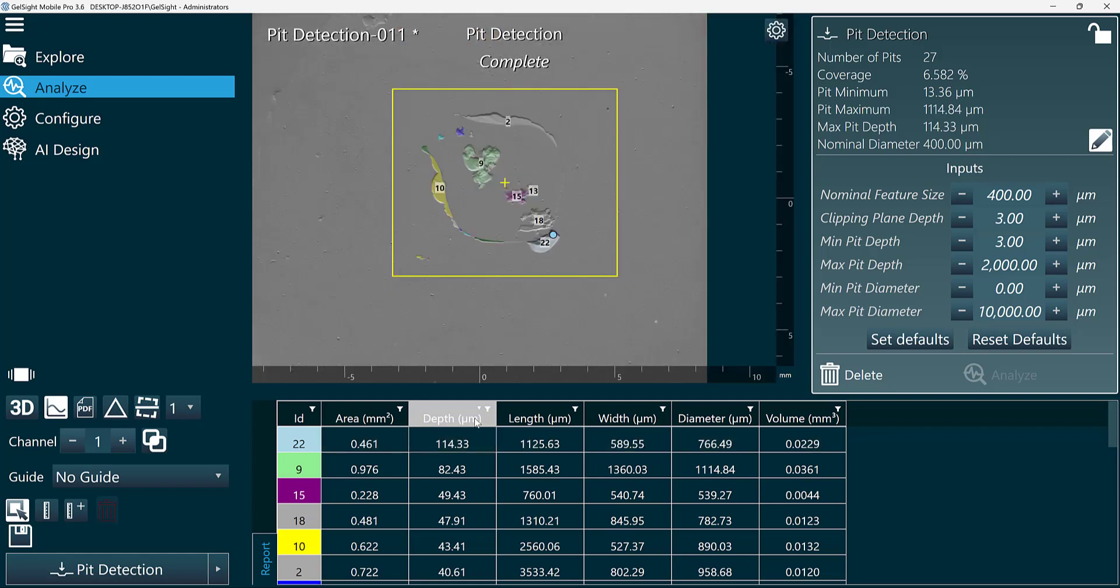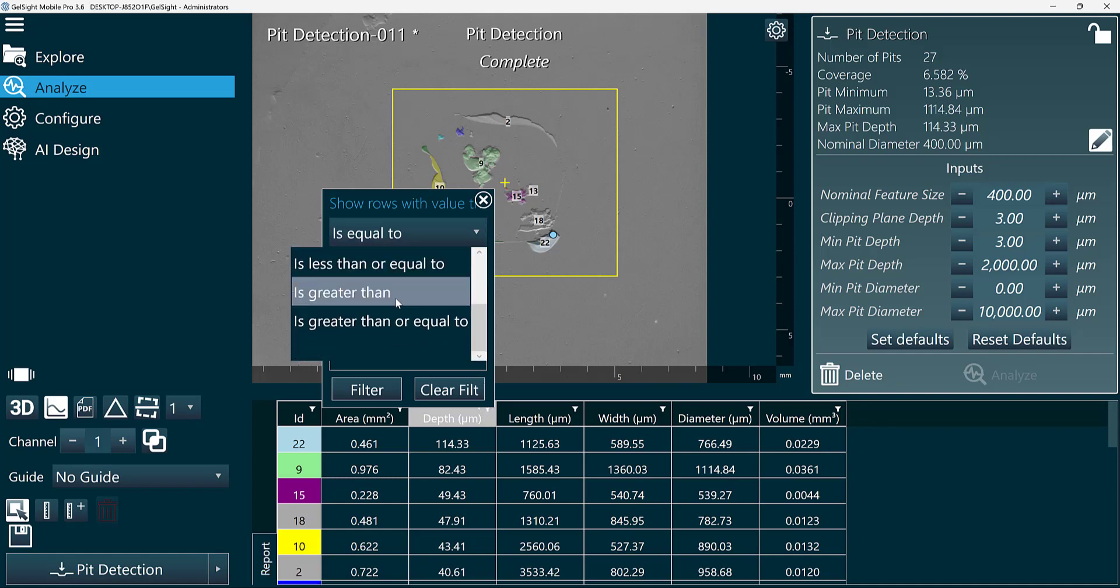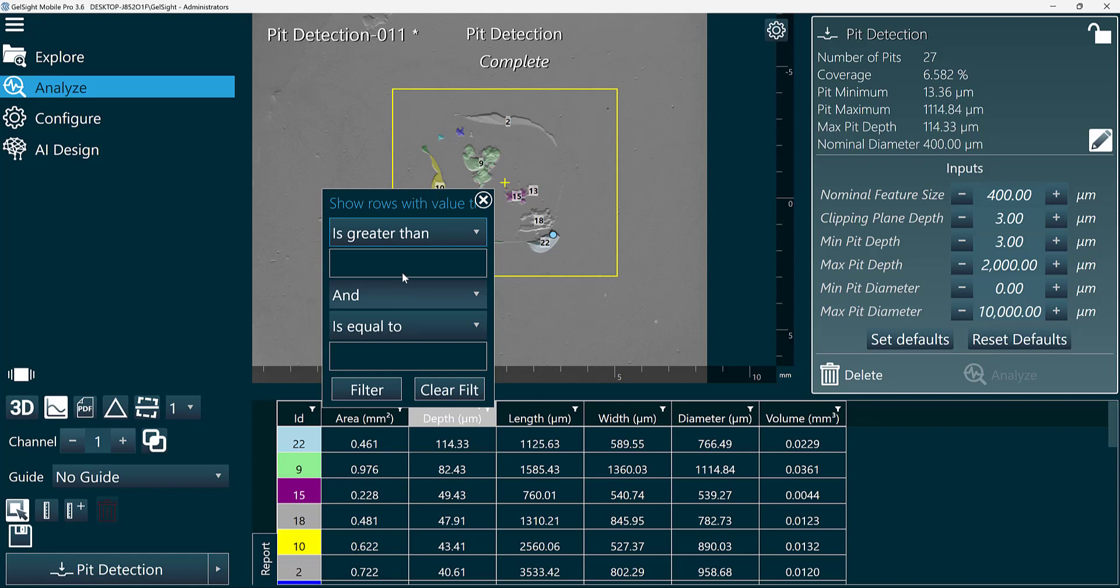Maybe I want to ignore pits that are less than a certain depth. I can go ahead and click on this filter icon here, and only show pits that are greater than maybe 40 micron.